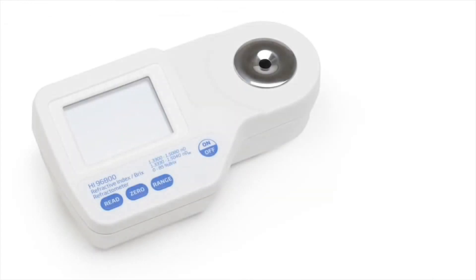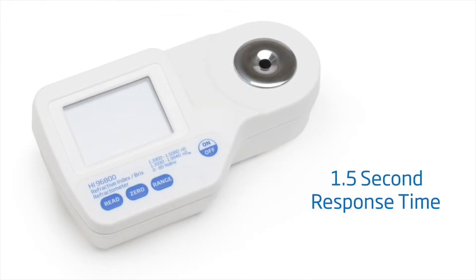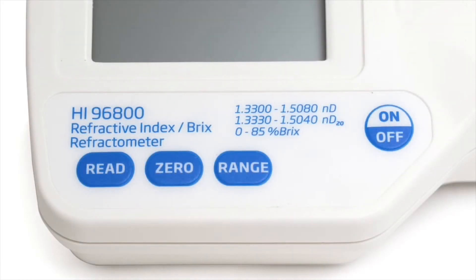The response time for taking a measurement is about 1.5 seconds. The HI-96800 has a very simple layout with four dedicated keys: one for turning the meter on and off, one for calibration, one for taking a sample measurement, and one for selecting the appropriate range to be displayed.